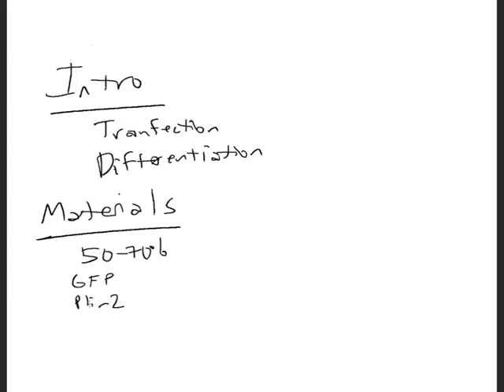And really the only difference between these two vectors is that the plin2 gene is added on top of this. So they're virtually the same, and other than that, they're identical to one another. These are the two plasmids we use for the transfection. Obviously, the way we set it up is we're going to have a 96-well plate with some controls. A couple of wells, we would have done the GFP control, and the other wells, we would have done the plin2.